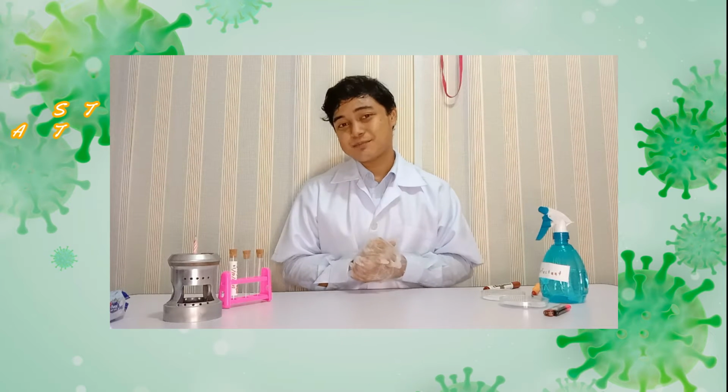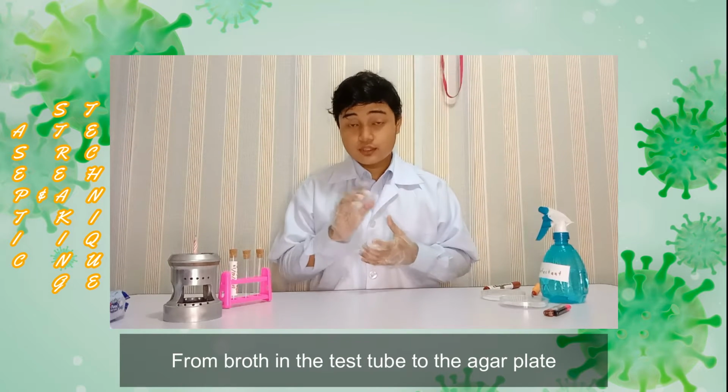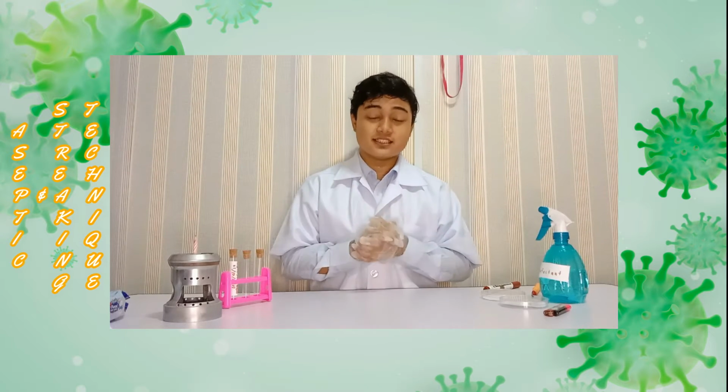Okay, so in this video, I will demonstrate how to use aseptic technique and streaking techniques to transfer bacteria from broth in the test tube to the agar plate. I will explain a little bit about aseptic technique and streaking technique before I proceed with the demonstration.